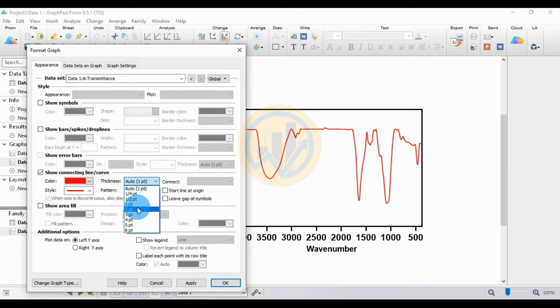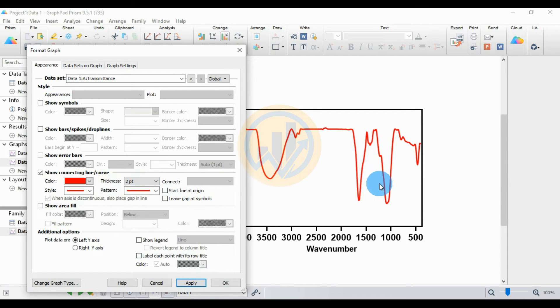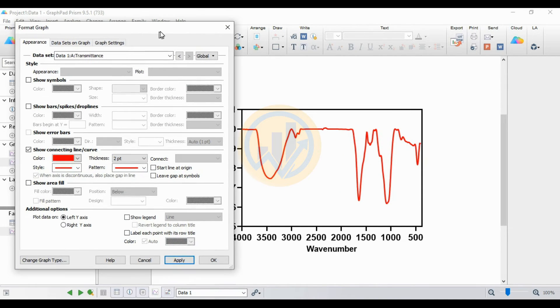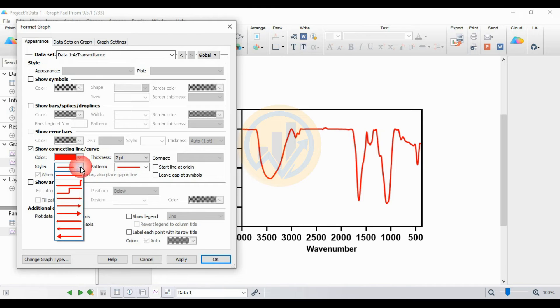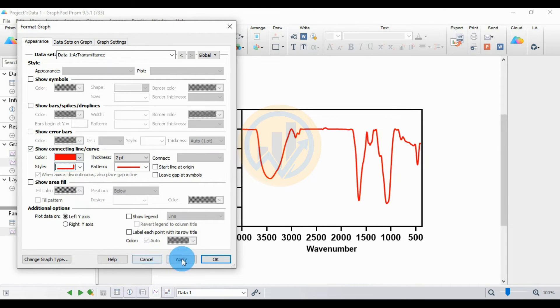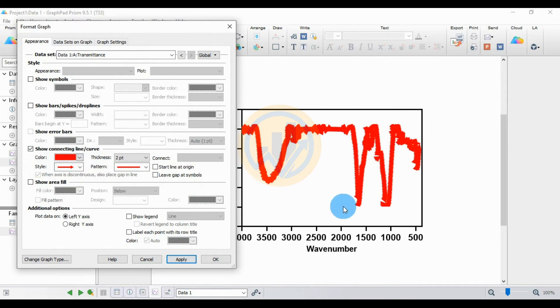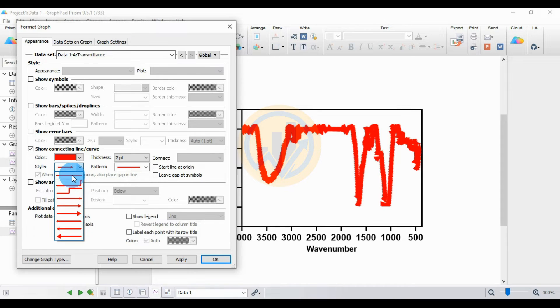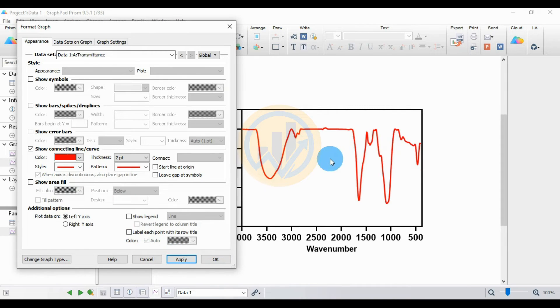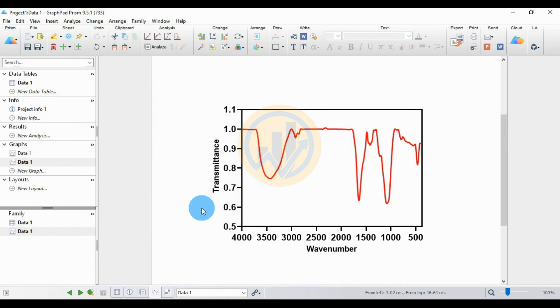Change the line thickness from 1 to 2, then click Apply. The curve thickness is now 2. For the line style, choose the first option for a smooth line, then click OK.